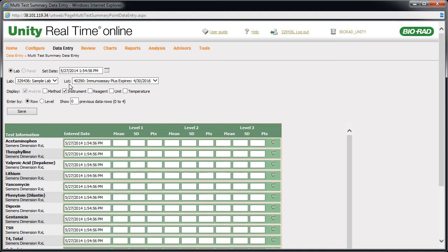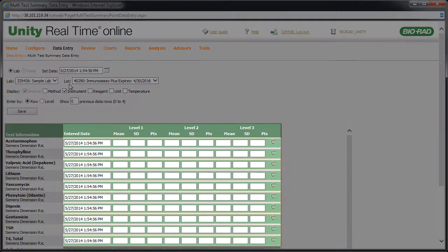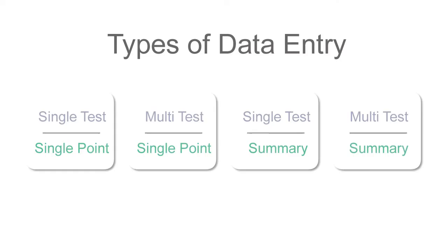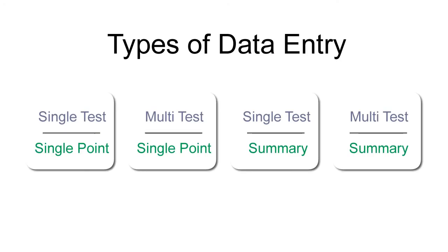The difference is that here you can enter the mean, SD, and number of points for each test. Now that we've looked at all four types of data entry, choose what's right for you.